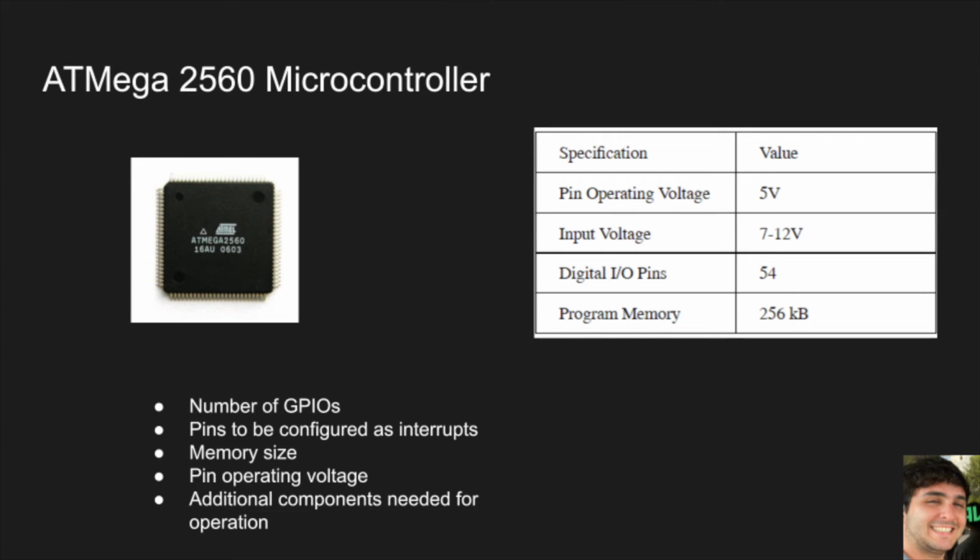In order to control all of the parts of this robot, we chose to use the Atmega 2560 microcontroller chip. This chip was chosen due to its large number of GPIO pins which are needed to control the 5 motor drivers, parallel gripper, TFT display, Bluetooth module, and the fan heater. The Atmega 2560 chip also has 256 kilobytes of memory needed to store the large code size of this robot.